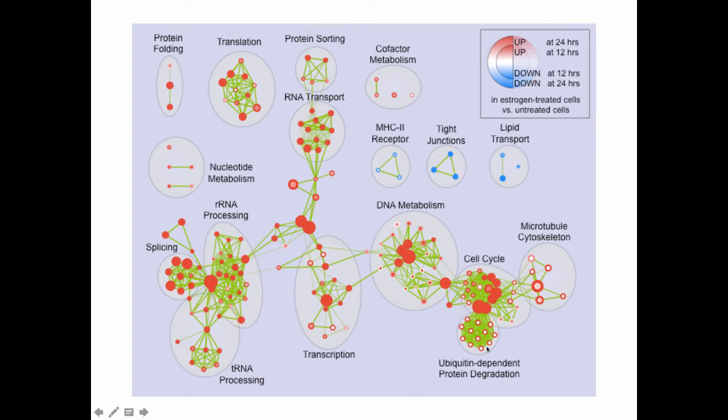However, this ubiquitin-dependent protein degradation is white in the center and red at the border, meaning it's not seen at the early time point as differentially expressed, but at the late time point it's highly differentially expressed. This provides a very quick visual summary of the results - in this case two different pathway enrichment analyses. I can very quickly identify parts that were found at the early but not the late, and late but not early. If I was interested in seeing the difference between two time points, I could quickly see which pathways are uniquely changing.